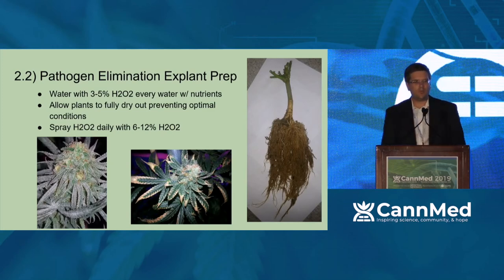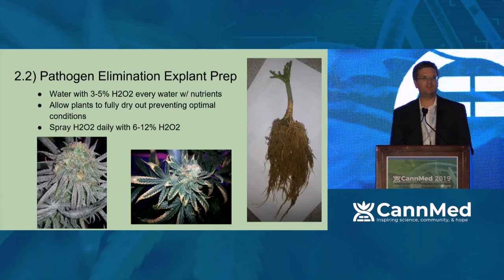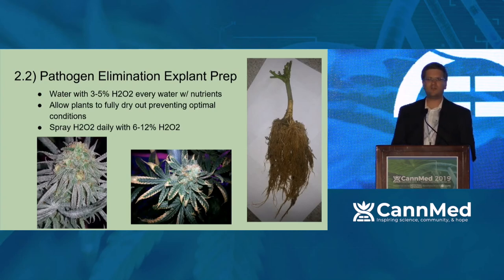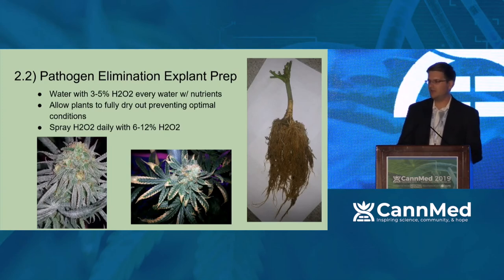So what I did was I noticed we were using inoculants that had endophytic properties, such as the Bacillus. To get rid of them, I watered with hydrogen peroxide at about a 3-5% concentration every day while adding in my nutrients to my water. Over the course of about 3 weeks, I actually was able to recover some of these plants to the point where the pathogens, or the endophytes, slowed down inside the plant tissue itself, and you were able to get a couple clean in vitro cultures. And that was huge. Maybe not all of them, but some of them would take.